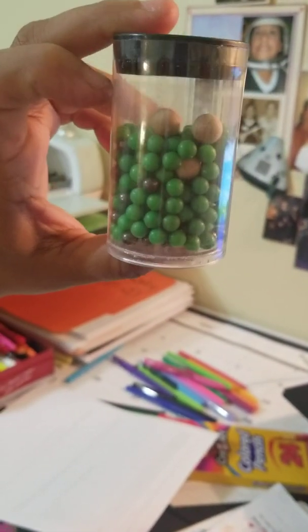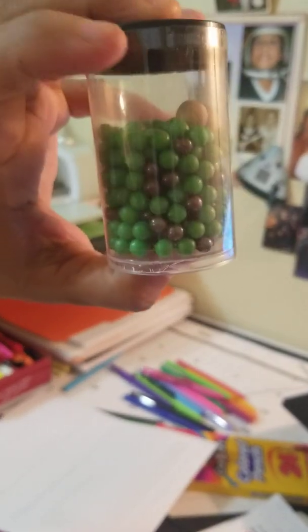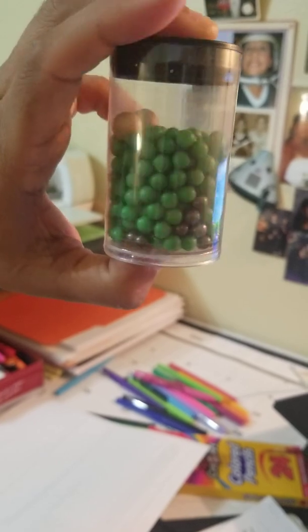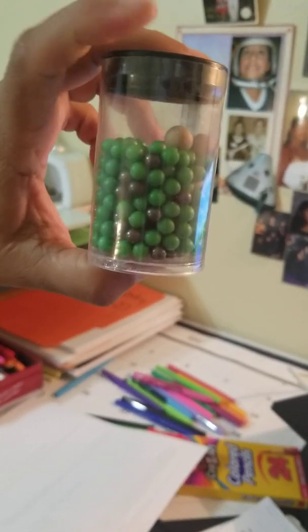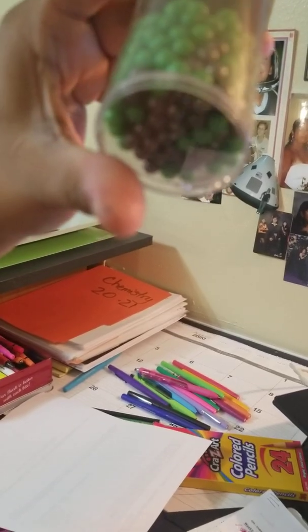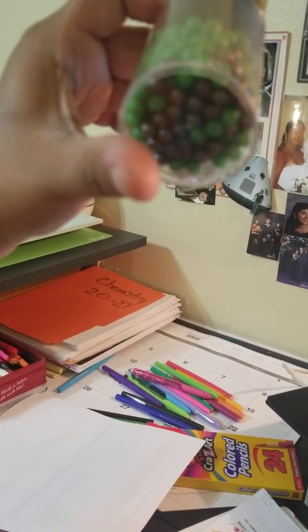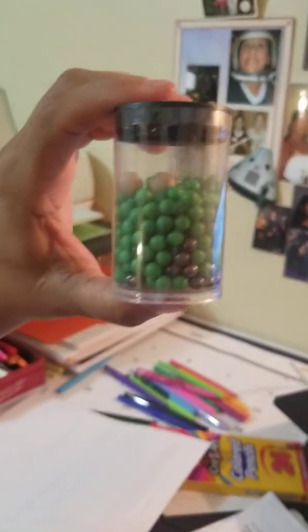2 of the brown wooden balls are at the top. This third one is almost to the top. Let's take a look on how the black metal balls, majority of them are at the bottom or halfway. They're moving their way to the bottom. And look at the bottom of this. Almost all of them are black metal balls versus the green ones. Okay, this is going to be your 4th one.